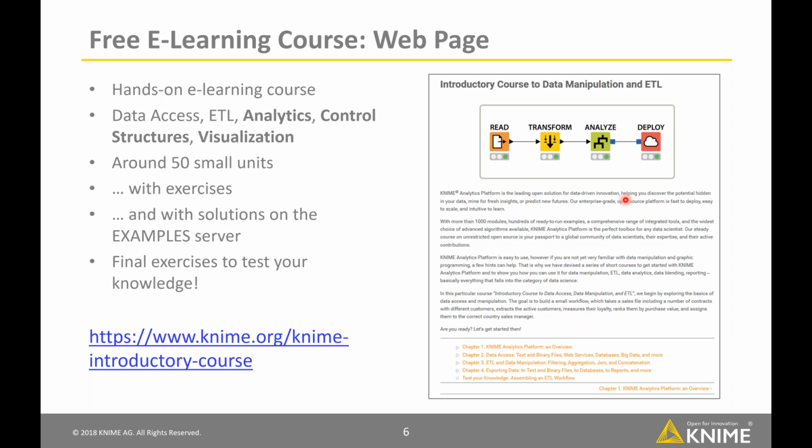It is somewhat overwhelming. You have this big package with all of these nodes. So we're trying to figure out ways to make it easier for people to get started. One of the ways we're doing that is we have the free e-learning course now, and it's available from knime.org. There's this introductory course. This is a series of small units that don't take very long to complete, that include exercises and solutions that allow you to learn how to use Knime in kind of a structured way. We're continuing to expand this.